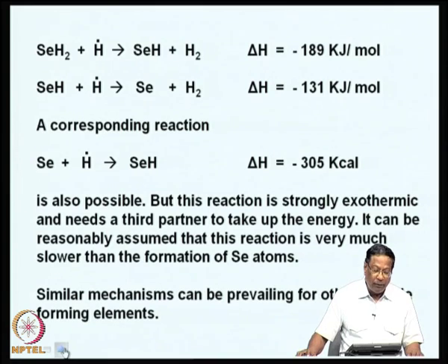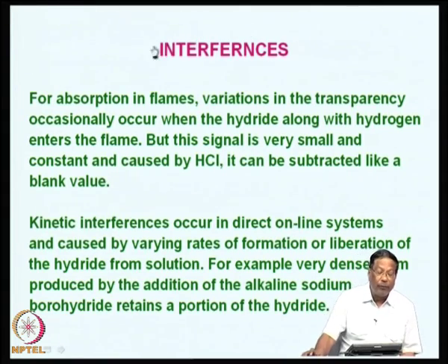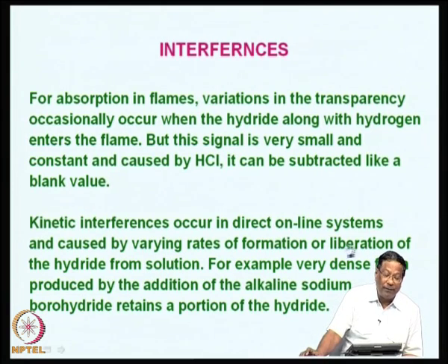I want to give you the reactions of other hydride elements as homework, what type of reactions can occur. You can look up some of the textbooks, they are described therein. Now, let us discuss the interferences.